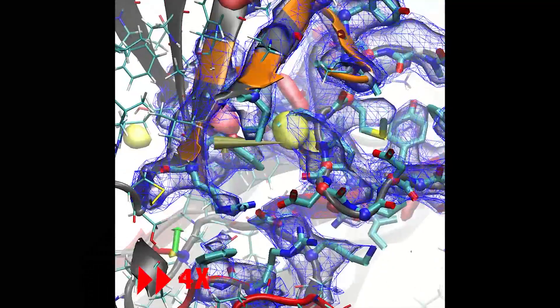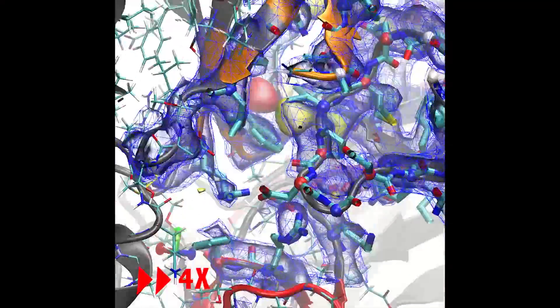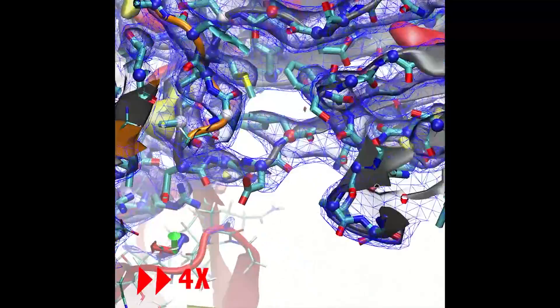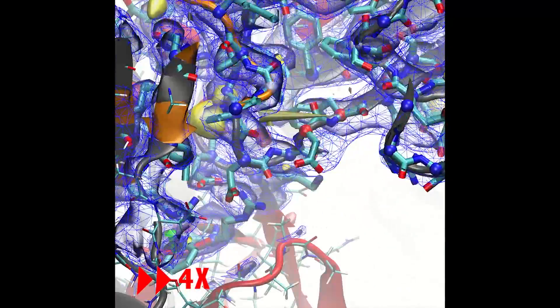Testing them in real-time not only against fit to the data, but also against physical fit to their local environment and the likelihood of their backbone configurations.